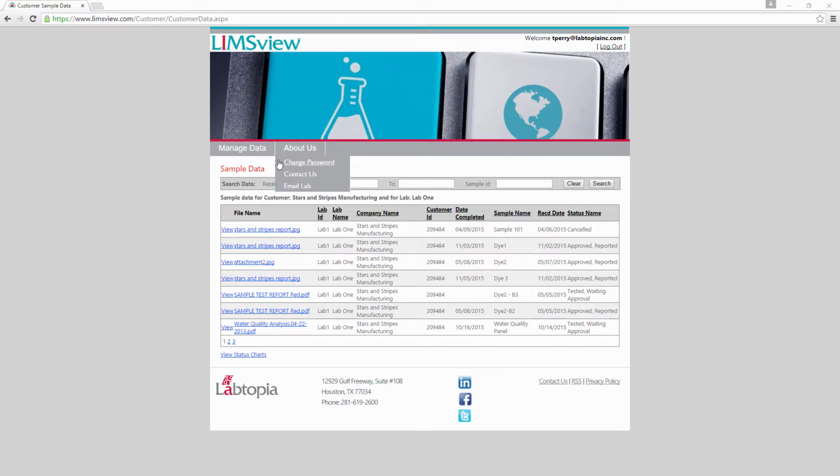It's a way to deliver a sample status, test reports, pictures, or any type of uploaded document to your customers and have them notified immediately when it's uploaded. Gone are the days of having to contact the laboratory for that information.